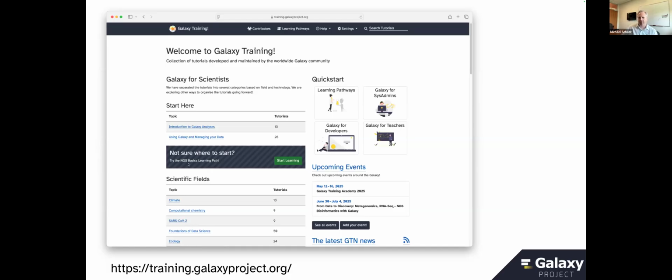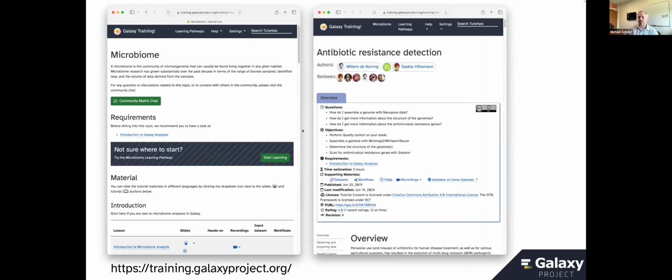There's also, if you're new to Galaxy and you want to get up to speed on how you do different analyses and how you work with different data sets, dozens of tutorials on that. So there's lots of resources available to support you. So again, if it's 2 a.m. and you're not sure what to do, go to the training network here. There's probably a good resource. If it doesn't do exactly what you need to do, it'll get you really close. And then hopefully, once you're in the system and really close, in a few extra clicks you can get where you need to be.